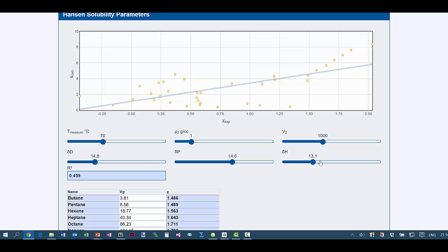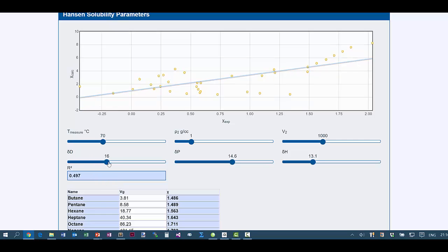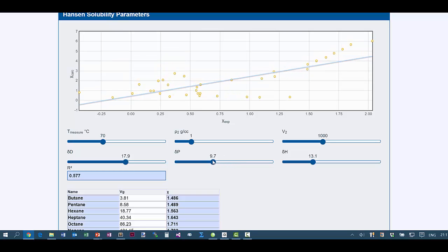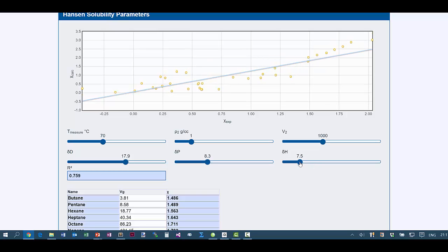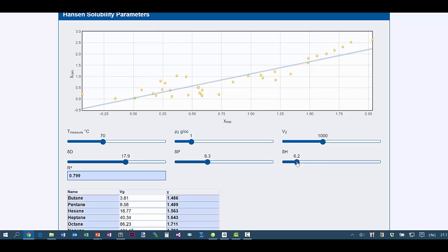Then we have a guesstimate of the D, P, and H values for that polymer. And this is clearly an awful estimate because the correlation is very weak to the human eye, but also the R squared is only 0.46. So let's play around. Now, obviously, in reality, you would use a proper least squares fitting, but it's useful to build up an intuition. As I increase DD, things seem to be getting a bit better. As I decrease DP, things seem to be getting a bit better. And as I decrease DH, things seem to be getting significantly better.